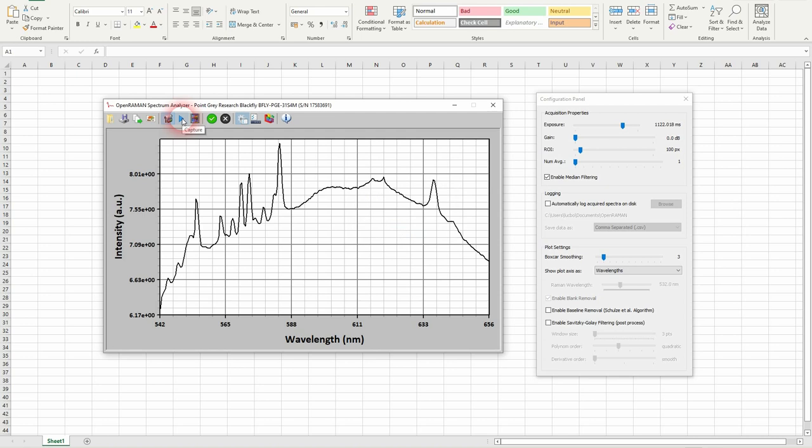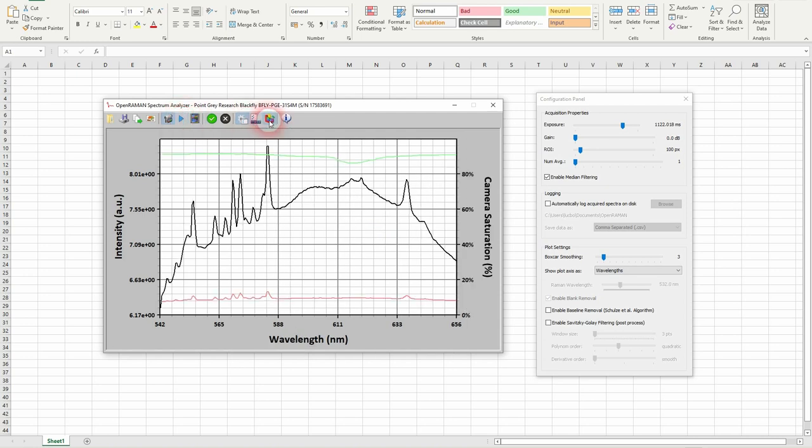And I will take one spectra. And I will show the saturation. So you see that we are really low, like 10 percent.